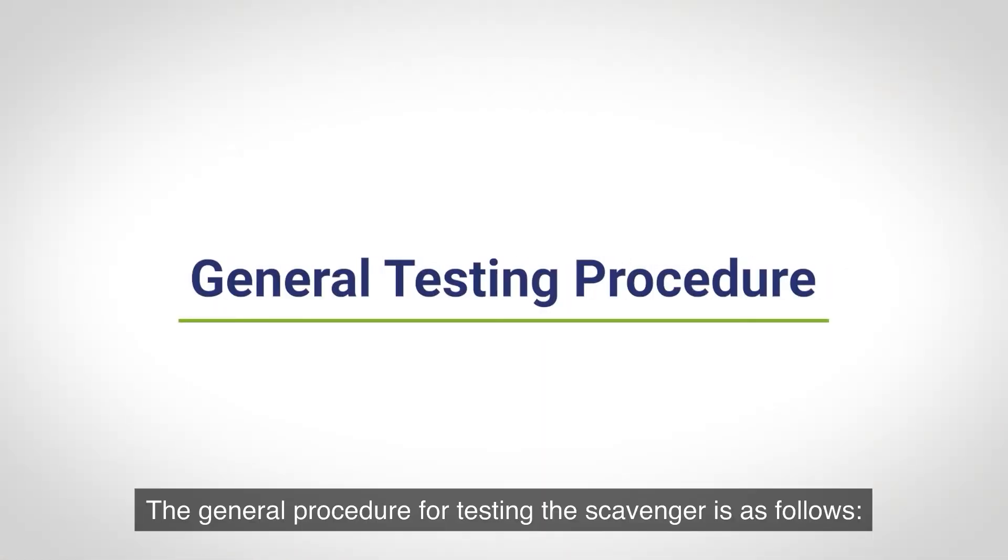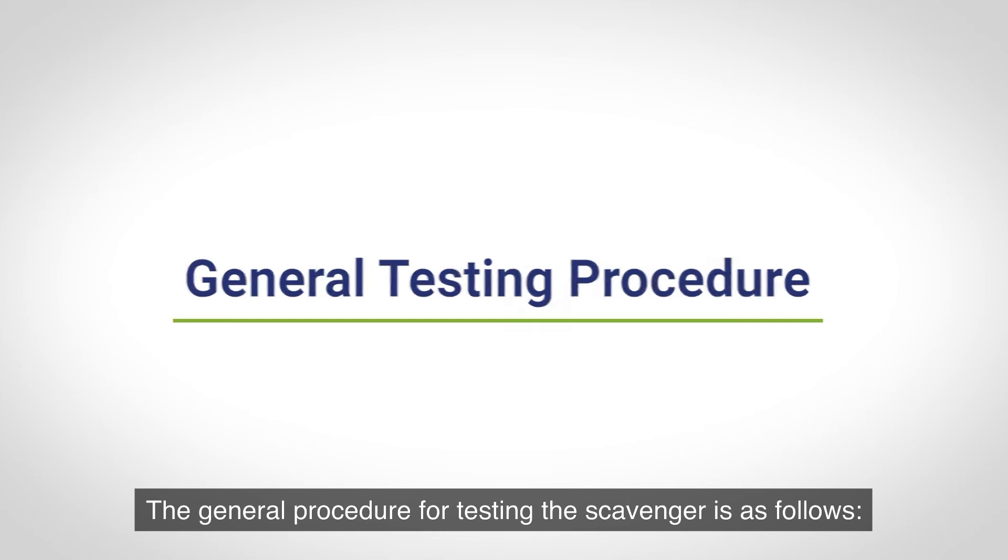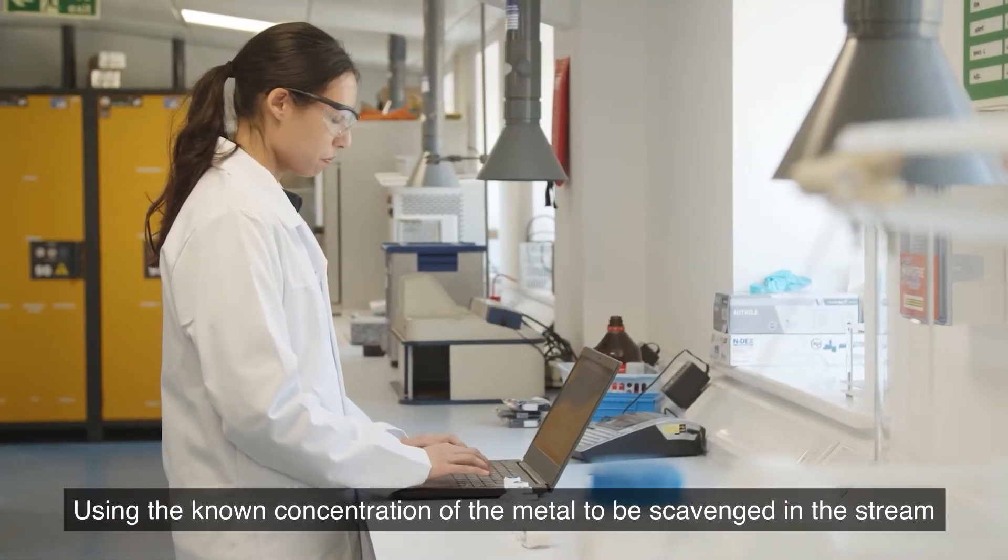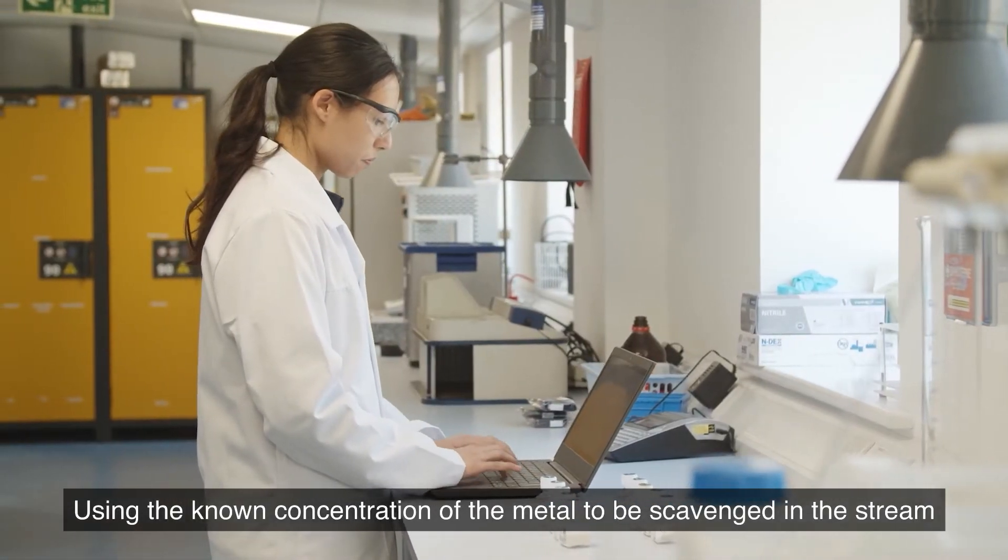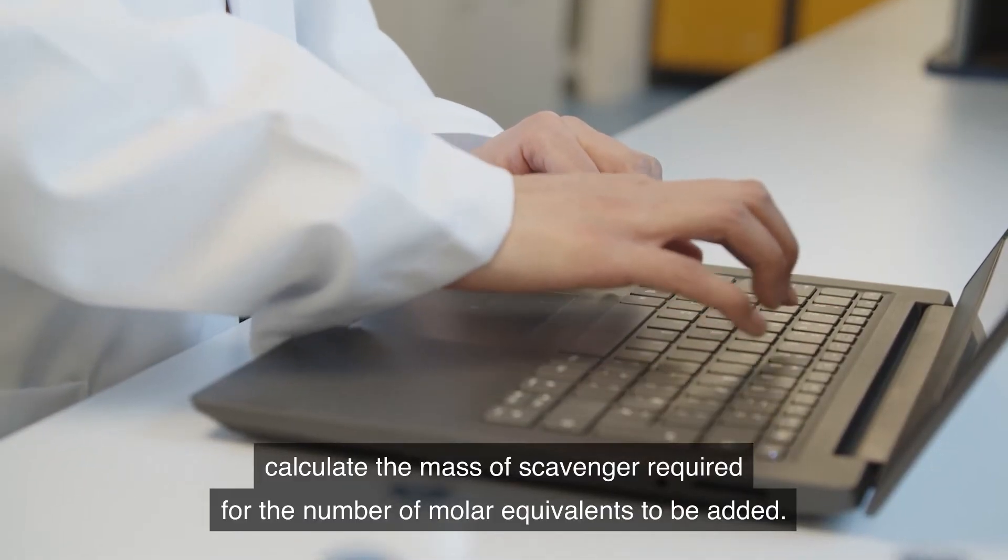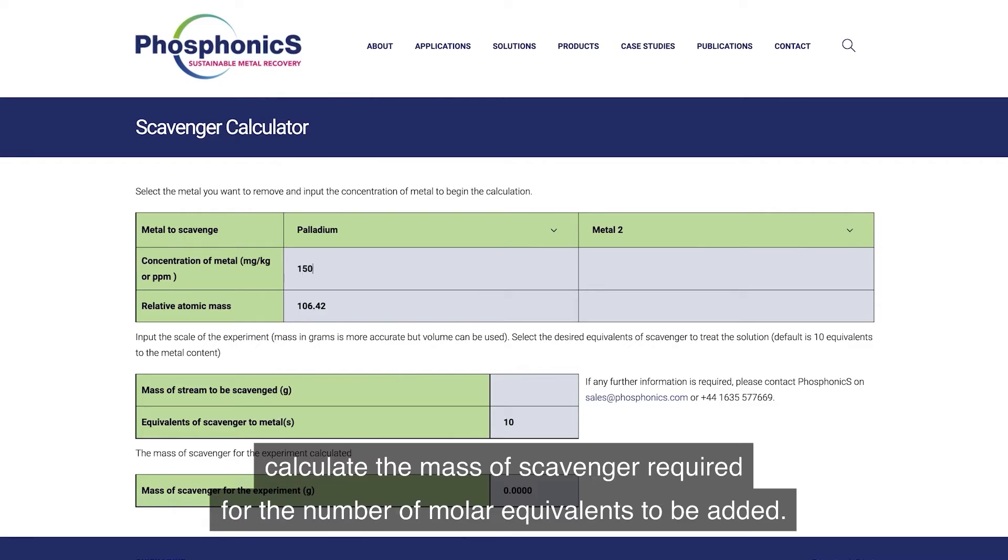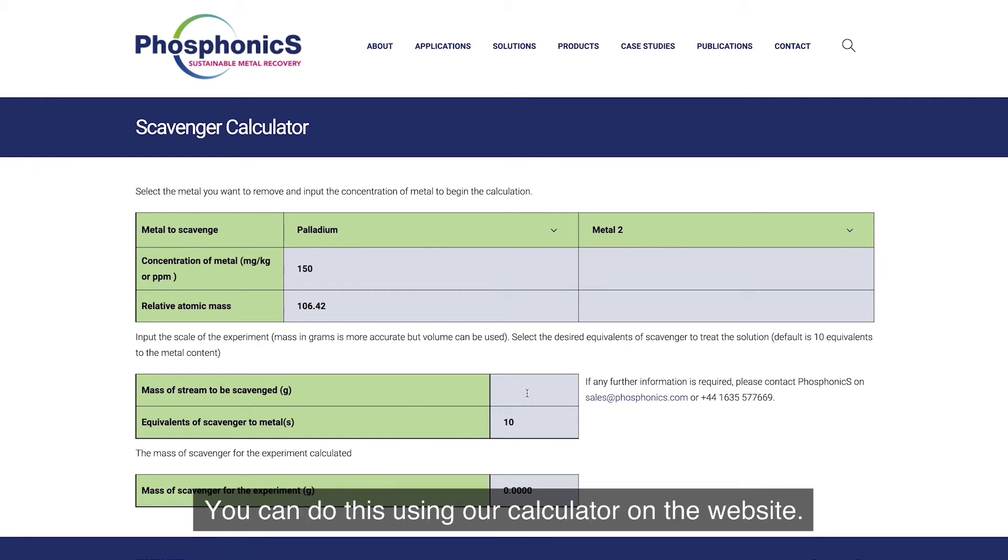The general procedure for testing the scavenger is as follows. Using the known concentration of the metal to be scavenged in the stream, calculate the mass of scavenger required for the number of molar equivalents to be added. You can do this using our calculator on the website.